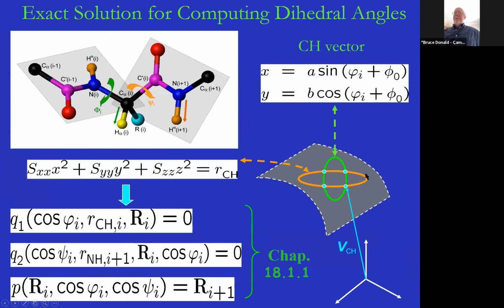So wouldn't the green ellipse change if we're depending on what the orientation of the previous peptide plane was? Well, there are only 4 solutions for that. So you look at all 4, right? You don't just choose the best one. That would be a greedy search.